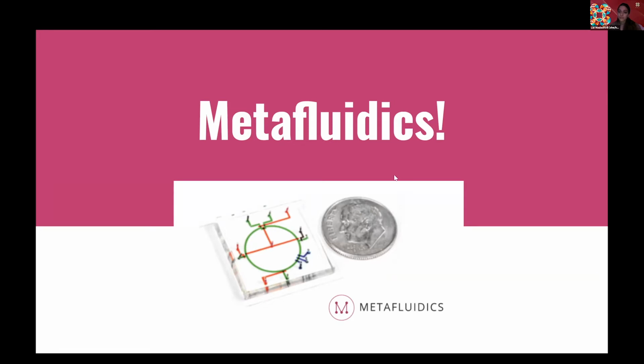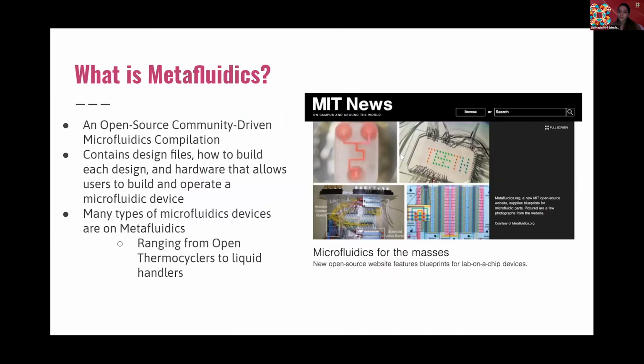So what is Metafluidics? It's an open source, community driven microfluidics compilation where people can upload their own microfluidic parts along with their design files and the hardware that allows users to build each microfluidic device. On Metafluidics, there's almost every single microfluidic type you can think of, including open thermocyclers, liquid handlers, and all of the types that Lizi mentioned as well. It was highlighted in the MIT News blog, showing how prominent Metafluidics itself was to the science industry.